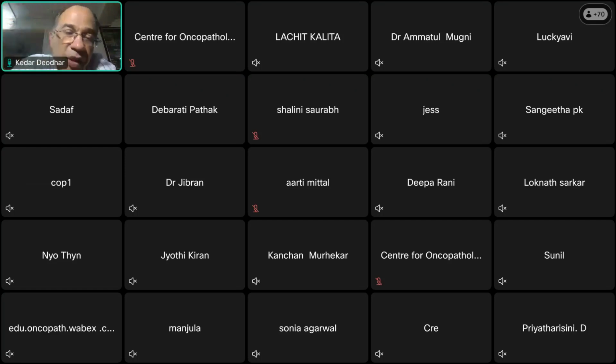I will sample very generously regarding the primary area, at least 5 to 6 sections. Sometimes the section is not faced properly. I will do deep cuts on that, and only then will I say no residual tumor. We may see acellular mucin, and that's regarded as no residual tumor. But a generous sample is required to call it no residual tumor.